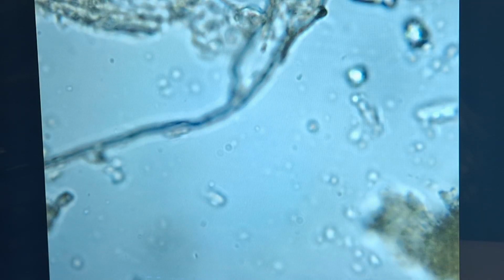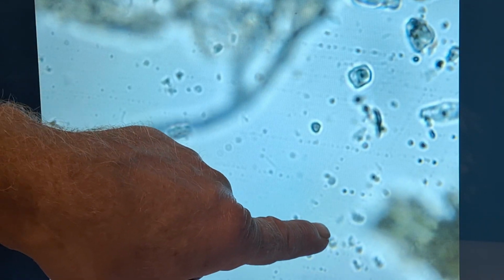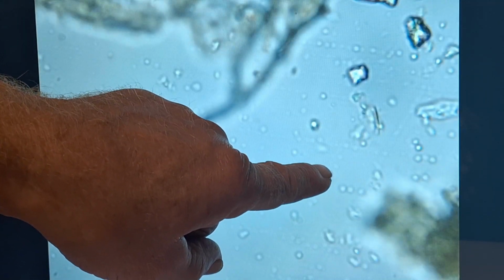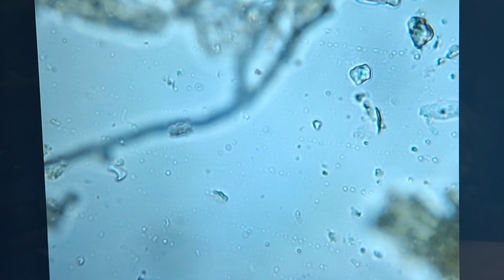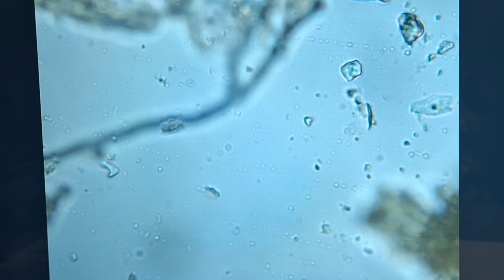And if we zoom back into the next layer, again, we can see lots. There's what we're looking for at the next level. We'll talk about that. That's a flagellate. Mostly by the way it's moving, it's hard to see. It's in a different layer. We'll zoom in and see if we can see it. We'll probably find a few of those. So you have the bacteria and the fungi.